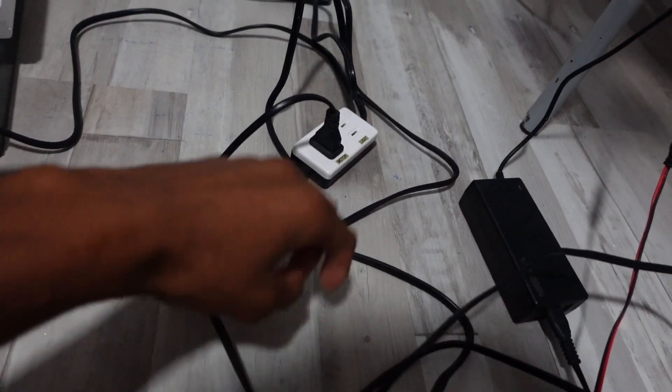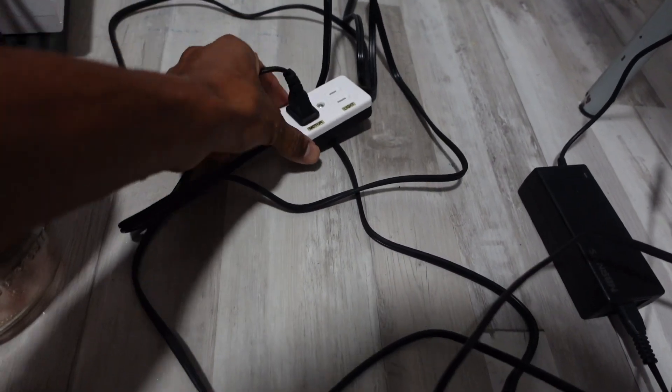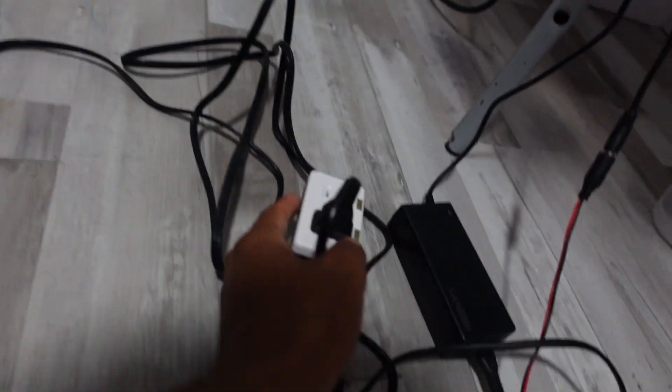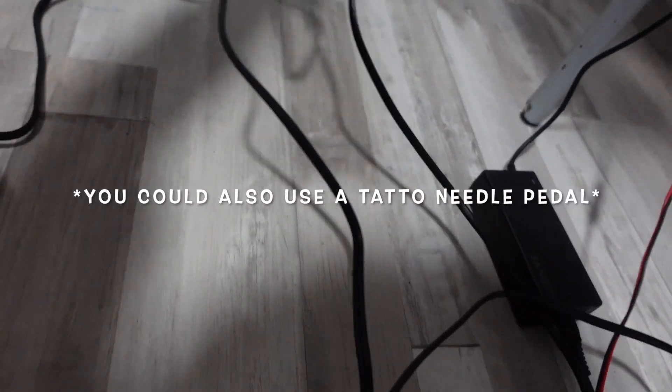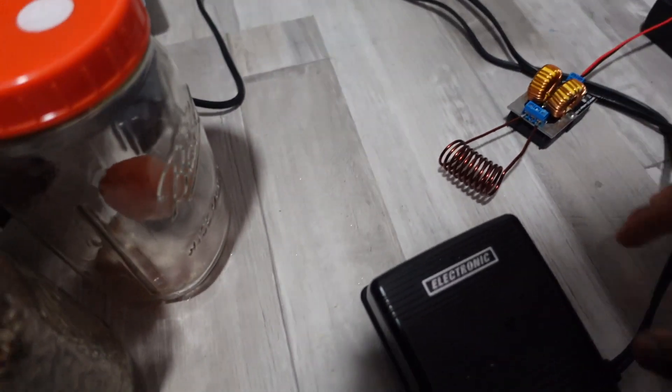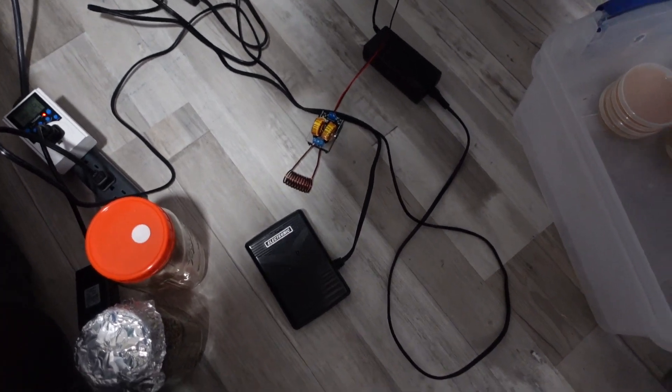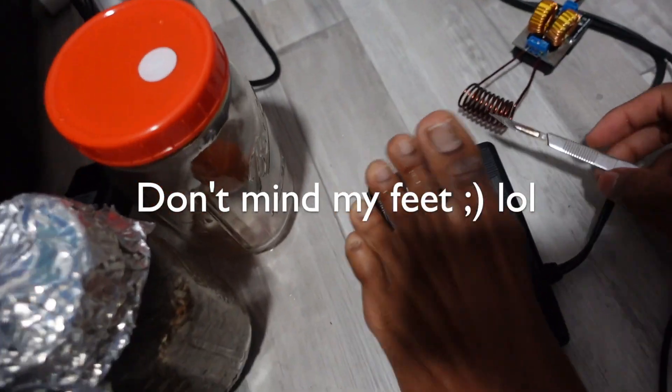The power source is connected to this sewing machine foot pedal, which controls the motor and the light. I got this for like $20. I just plug this into the wall and I control it with the pedal right here. Let me see if I can show you one hand.